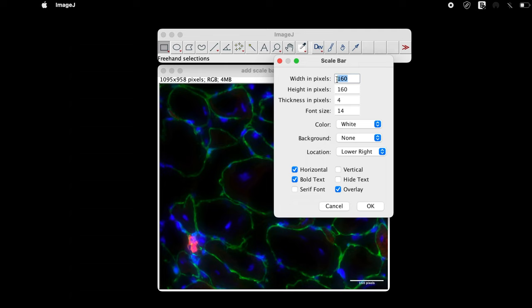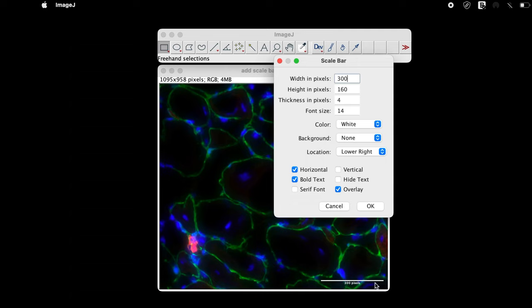By default the width in pixels is set to 160. This parameter can be changed according to your interest. For this tutorial let us put 300. Increase in the width of the pixels leads to increase in the length of the scale bar at the lower right.